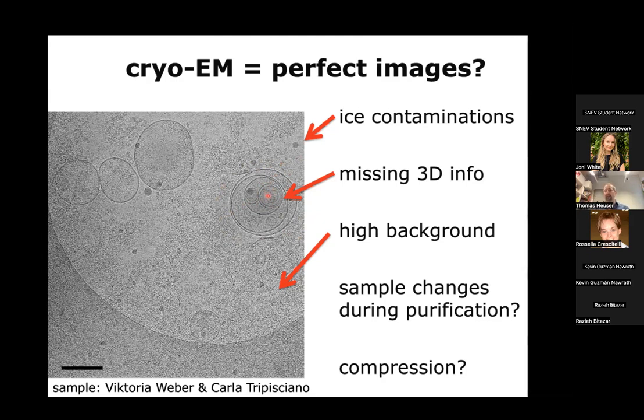Yeah. And one thing, especially for larger EVs, that's also important: our sample thickness is limited to somewhere around 1 micrometer.